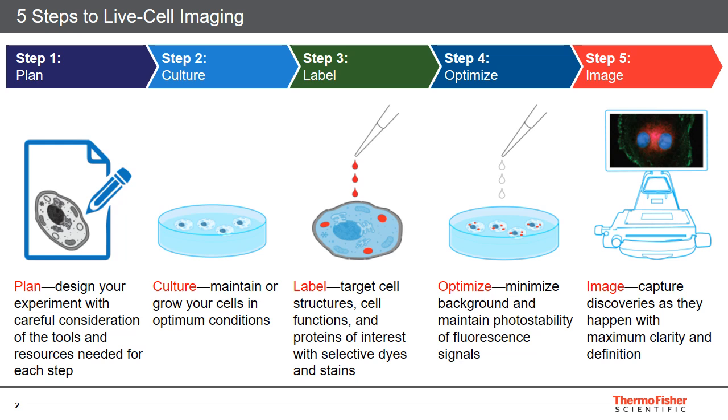most of the content in today's webinar on the last 3 steps, which is really where our expertise from the product development comes in, with determining the optimal types of labels for live cell experiments, as well as how to optimize your labeling and imaging conditions so that you can get quality data. And then last but not least, we will also touch base on how to go about actually performing live cell imaging without any detrimental effects, because as many of you are probably familiar with, when it comes to live cell imaging, it can be quite a bit more challenging than imaging fixed dead cells.